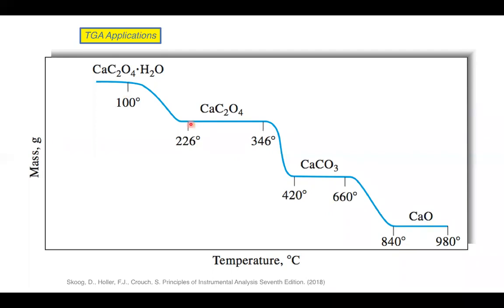We've got this process where it's decomposing in 4 steps until it's definitely no longer your product. But you could do this for other things. You could do this for some of the polymers that we saw earlier. Say you're making a window frame or something like that. You could check to see how your window frame will degrade over time, whether or not it will be suitable for a long service period in whatever application it's being used for.